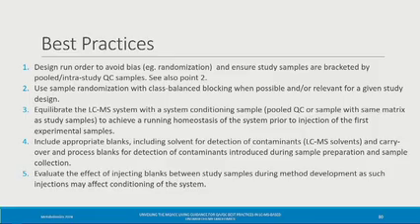Yeah, so for that, we'll have separate sections on the inter-study batch QC and reference materials. But definitely in terms of requirement, you should run either a long-term QC or reference material or both as part of each individual batch. So each batch should have those injections.